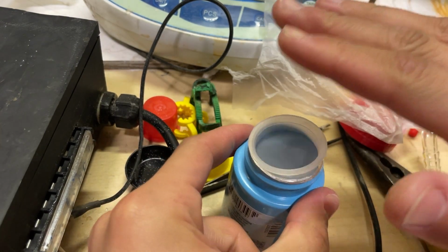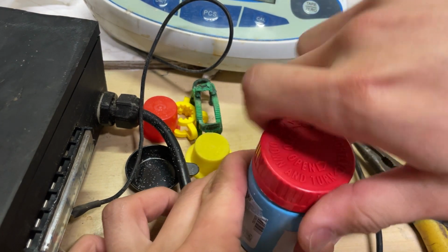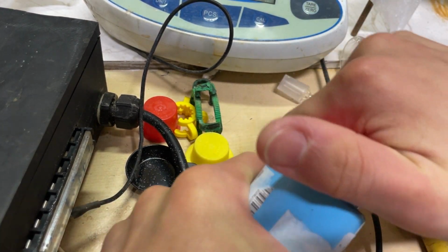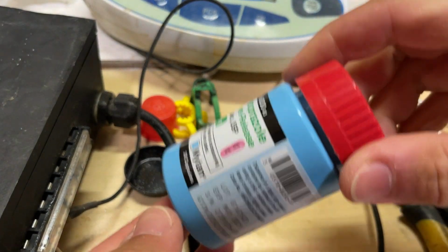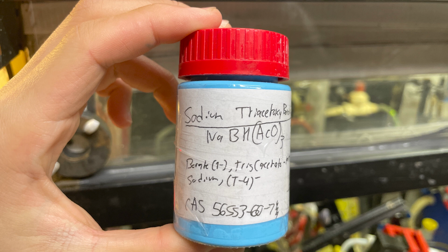Anyways, you want to cap this stuff pretty tightly because it is moisture sensitive, like borohydride itself is. But honestly, I'm not sure how important it is. Just to store it properly, you know. Don't put it in like a plastic bag. Put it in a nice little jar. And I'll relabel this, of course. And here's our final sodium triacetoxyborohydride.